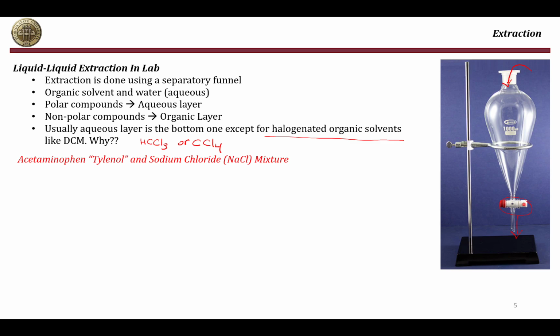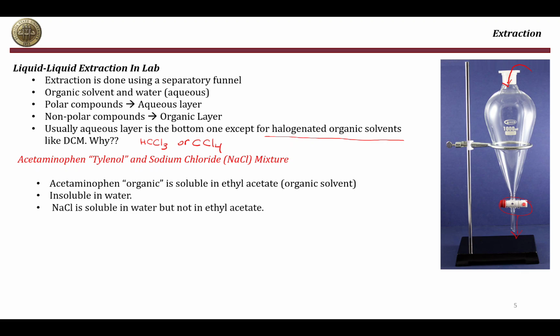So let's take an example of a liquid-liquid extraction case. Let's say we have a mixture of acetaminophen, which is the main component of Tylenol, and sodium chloride. Both compounds will be added to the separatory funnel. Acetaminophen, which is an organic compound, is soluble in ethyl acetate, which is an organic solvent, and it is insoluble in water. Sodium chloride is soluble in water, but it is not soluble in ethyl acetate.